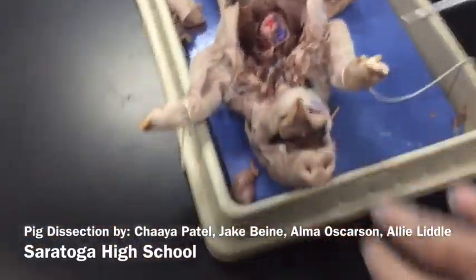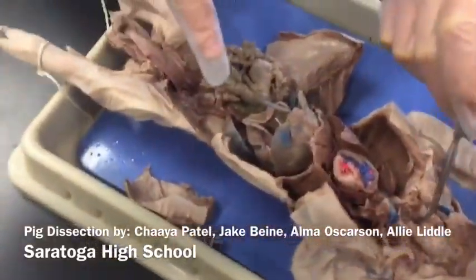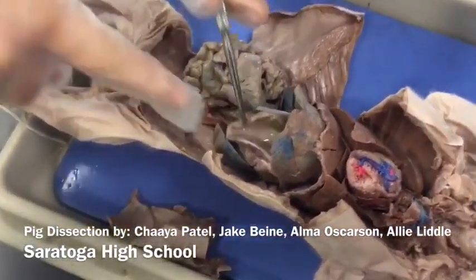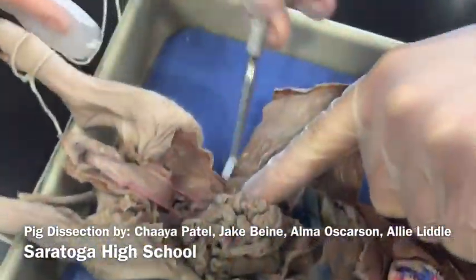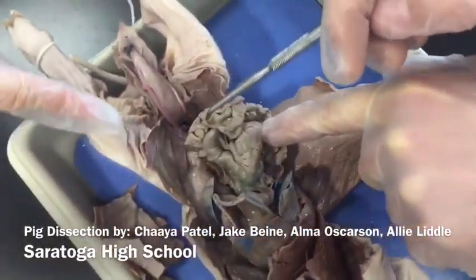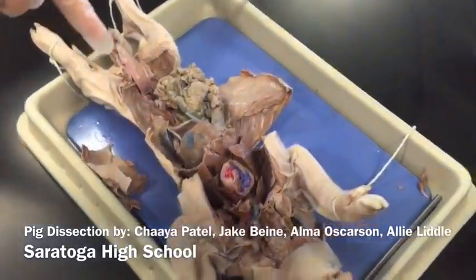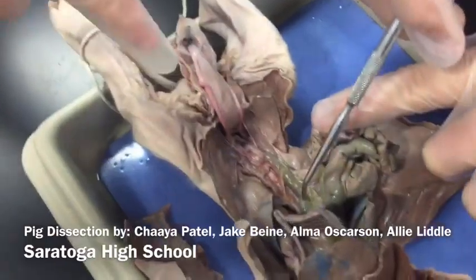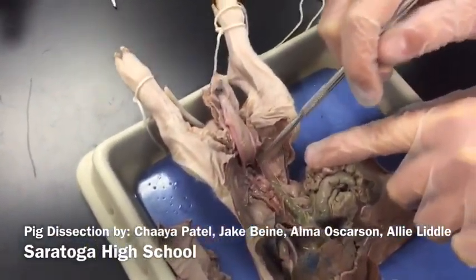And then it travels through the esophagus all the way down to the stomach, and the stomach is where the food is broken down. Then it travels into the small intestines, which are right here, which absorb all the nutrients, and then through the large intestines where water is absorbed. The large intestines take the feces down to the rectum where it's stored before it comes out.